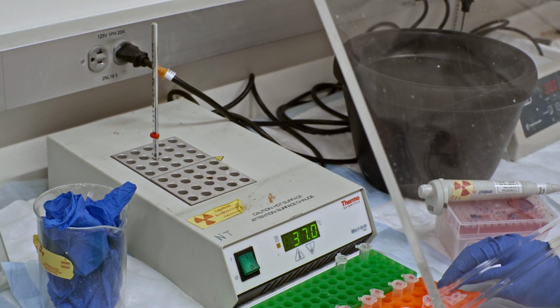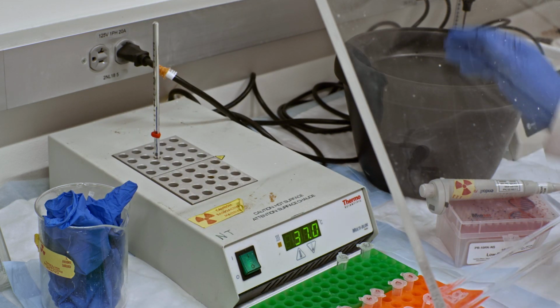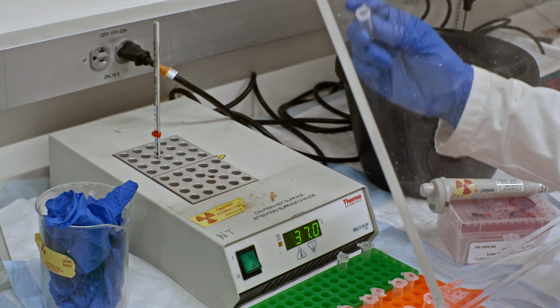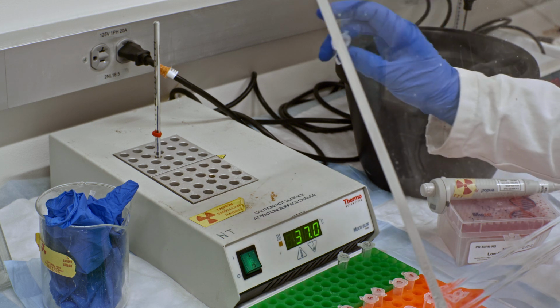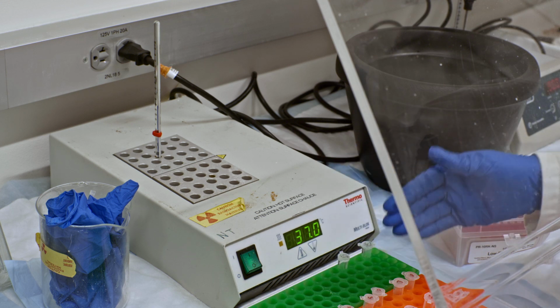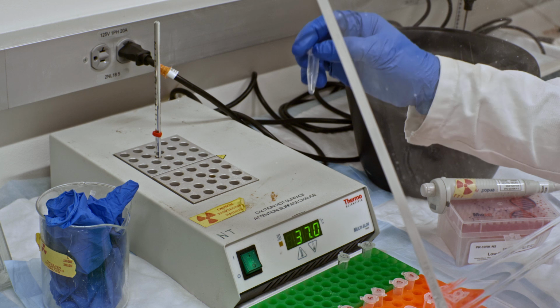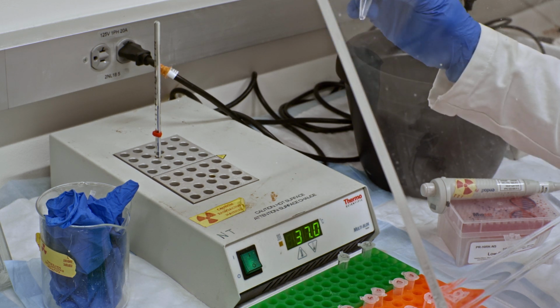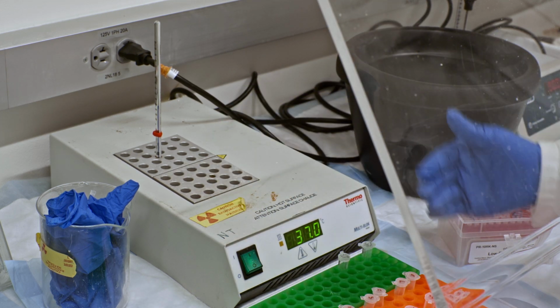So now it's time to actually start the experiments. With the time 0 time points collected, now all you have to do is to add a dNTP mixture of 50 micromolar concentration into each of these reaction vessels to get it started. Now, I like to keep these dNTPs on my ice until I have to add them to the reaction vessel. Once these dNTPs are in the reaction vessel, now you have polymerase, DNA, and dNTPs, which means that these reactions can now occur. You will incubate them at 37 degrees Celsius in order for the reaction to proceed efficiently.